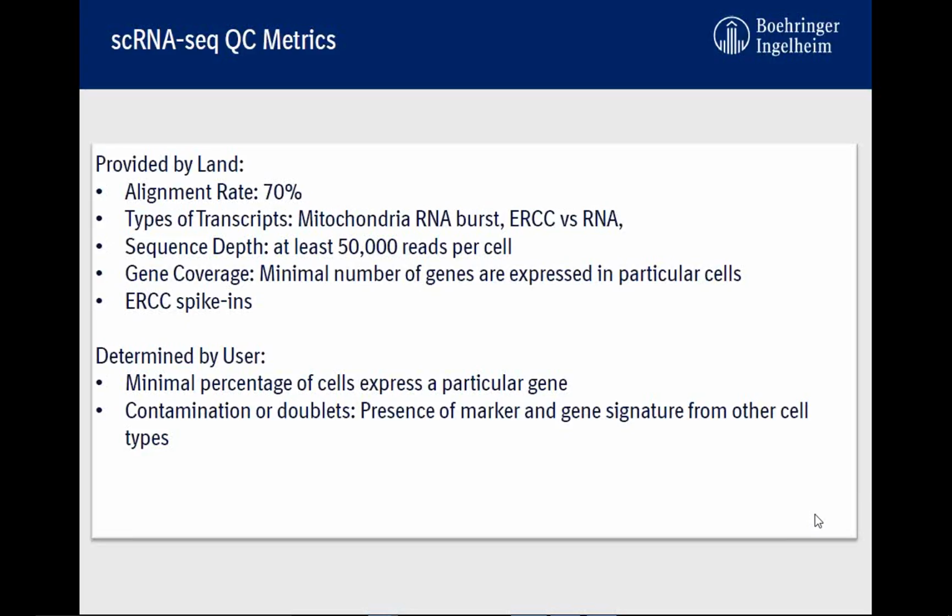If you're interested in one gene, but only 10% of your sample expressed it, how would you decide? Is this meaningful? Is this artificial? If you have a mixed PBMC, 1% of cells is probably extremely important, because they could be plasmacytoid cells, which play an extremely important role in immunity. But if you have a pure T cell population, 1% may be artificial.